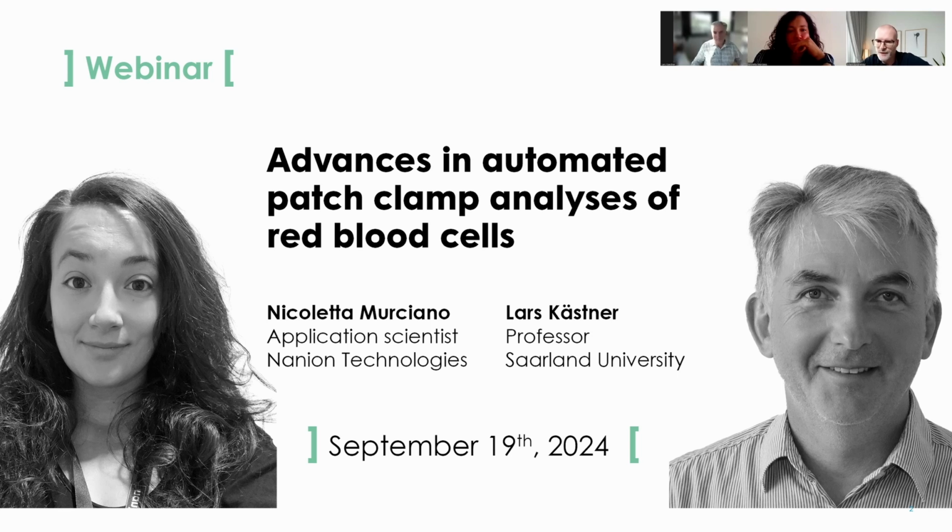Okay, thank you. And a question from Anna Bogdanova to Lars: would it make sense to monitor calcium oscillations as readouts of membrane potential transients using Fluo-4?